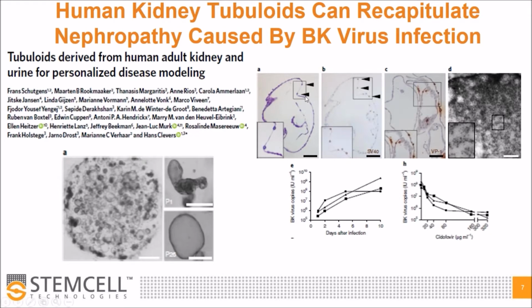They observed enlargement of the nuclei on the perimeter of the kidney organoid epithelium. These nuclei seem to be positive for viral protein. They could observe many viral particles within the cells in culture and also model the replication of the virus in this system. But very importantly, they show how this culture system could be used for drug screening purposes, as you can see here.